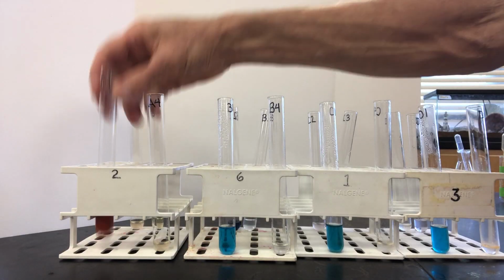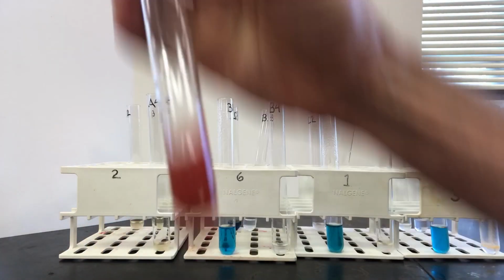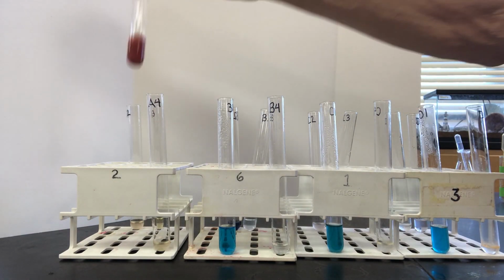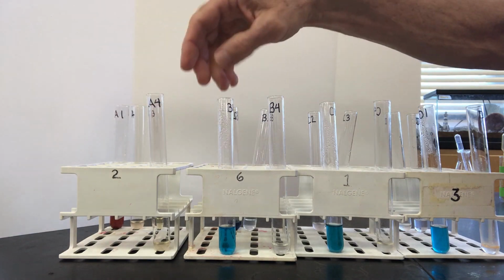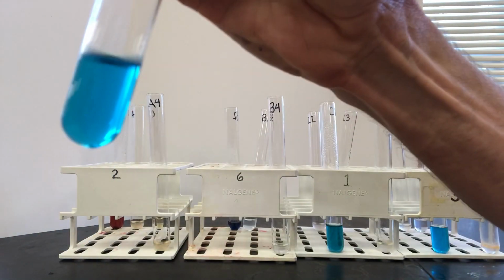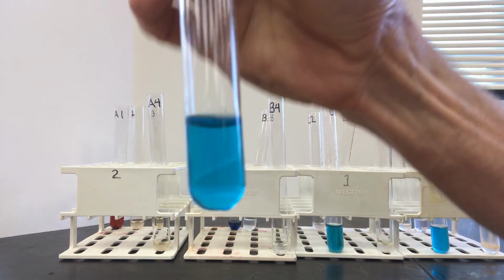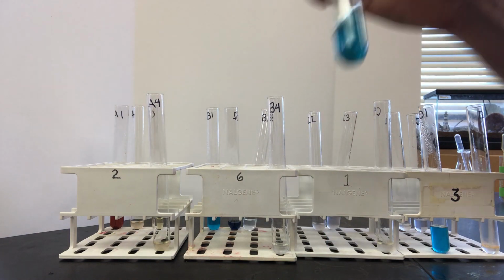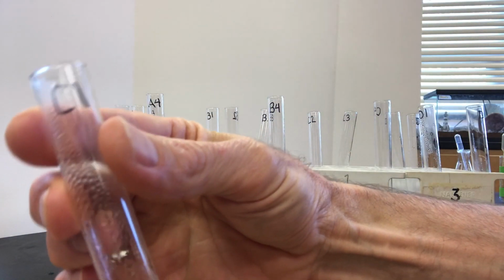Test tubes A through D, number 1, gave the following results for the Benedict's test. A1, apple, looks like this. B1, potato chips, looks like this. C1, refried beans, looks like this.